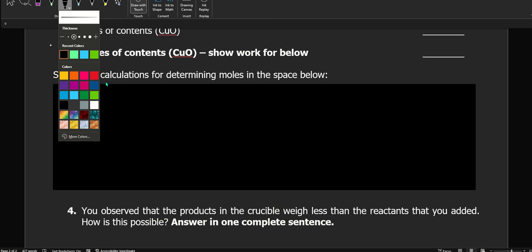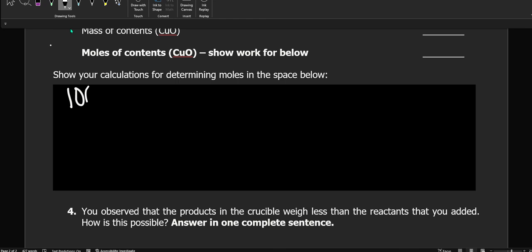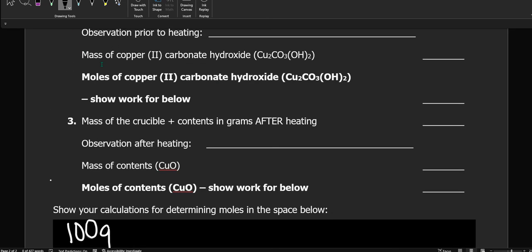We are going to just take, like I said, a random amount of malachite, and okay, there we go. So I'm gonna say, and now it's doing the opposite to me. Wow, isn't life funny? Okay, let's say we have 100 grams of malachite, right?